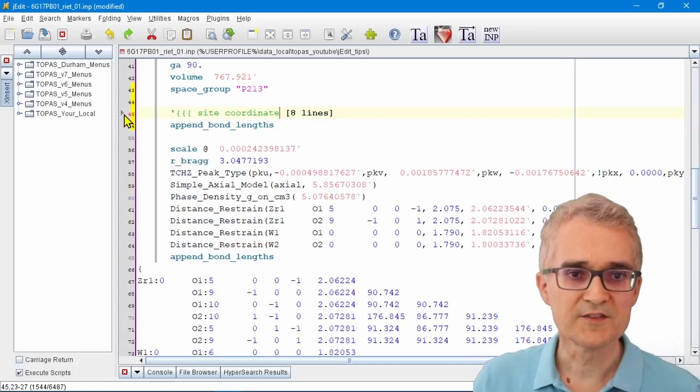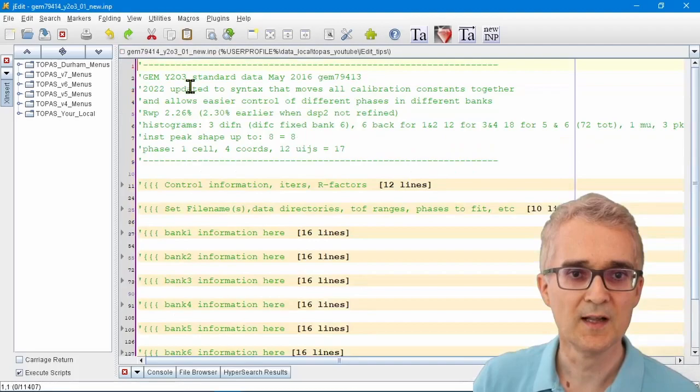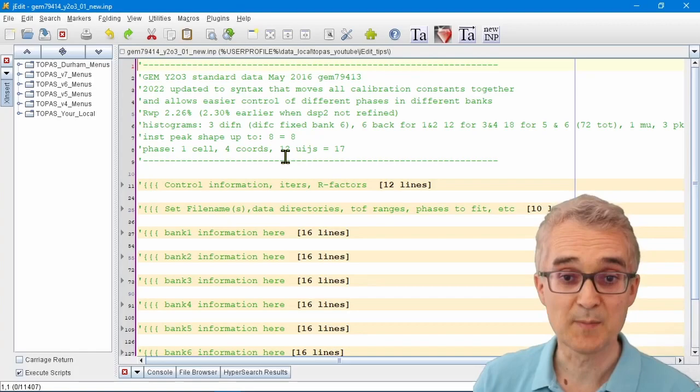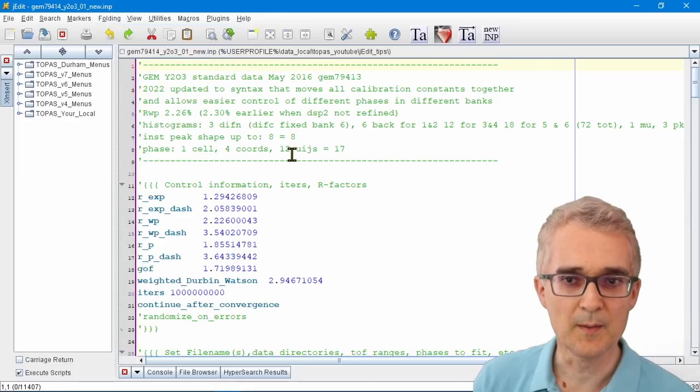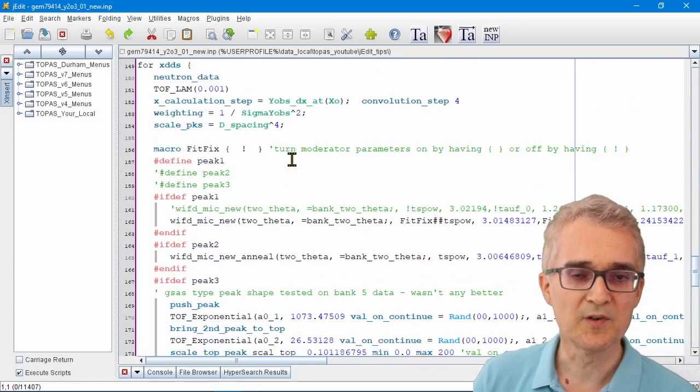That can be a very useful way of working. With simple files you don't need it, but let me show you a more complex Rietveld refinement file. This is a Rietveld refinement file for refining against six banks of data simultaneously on the time-of-flight neutron spectrometer. If I show you the full input file, you can see this is a long and complicated input file, but I've deliberately put folds on it.